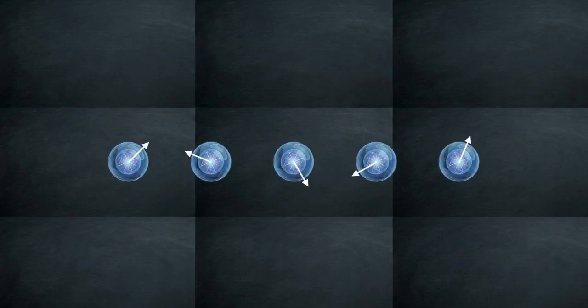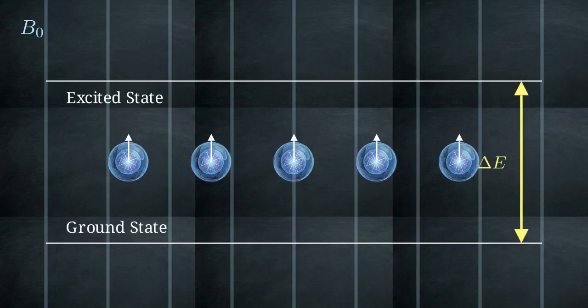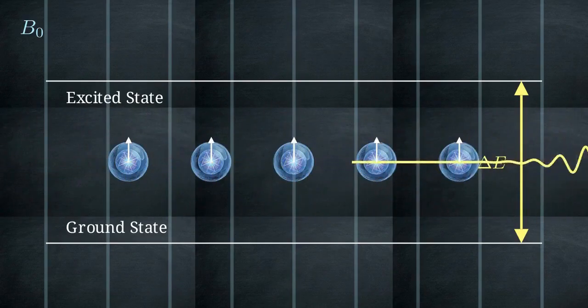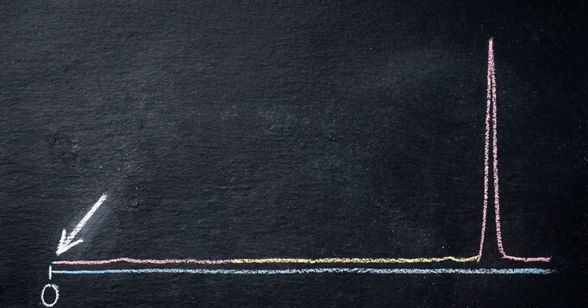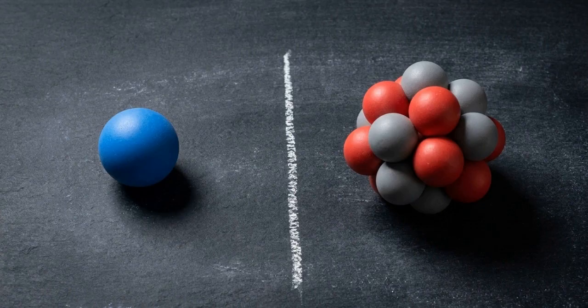When you place NMR active nuclei inside an external magnetic field, their spins align, creating discrete energy levels. Hit those aligned nuclei with specific radio frequencies, and they absorb the energy, flip their spin, and release a detectable signal as they relax back to normal. They even use the same baseline reference standard, tetramethylsilane, anchored right at 0 parts per million. Because they rely on the exact same underlying physics, their massive differences in practical lab utility stem entirely from the natural properties of the specific nucleus you choose to target.